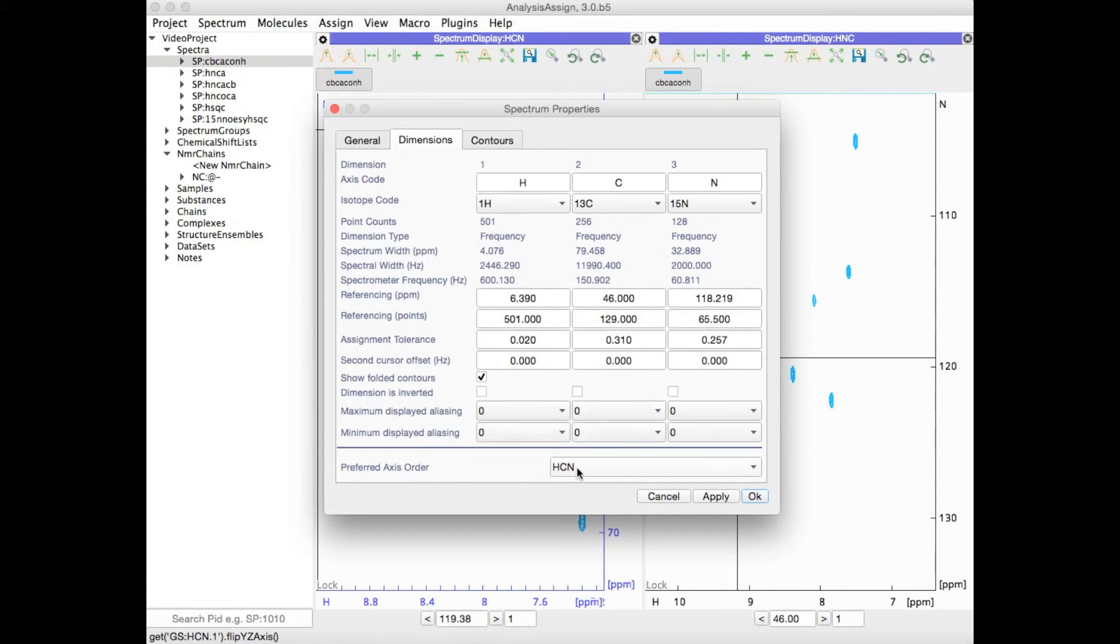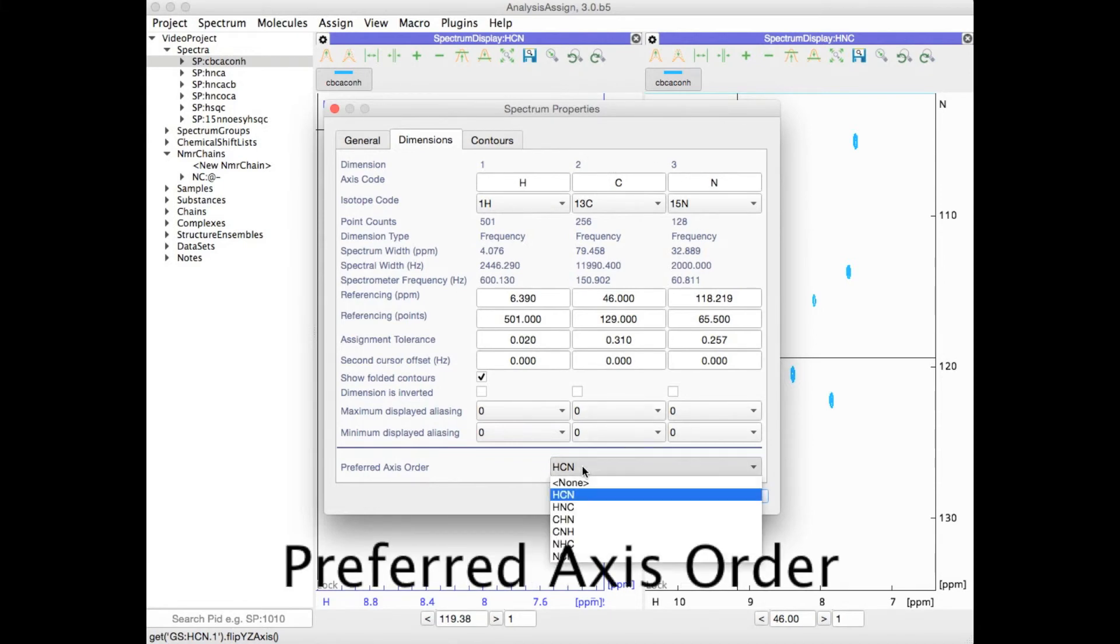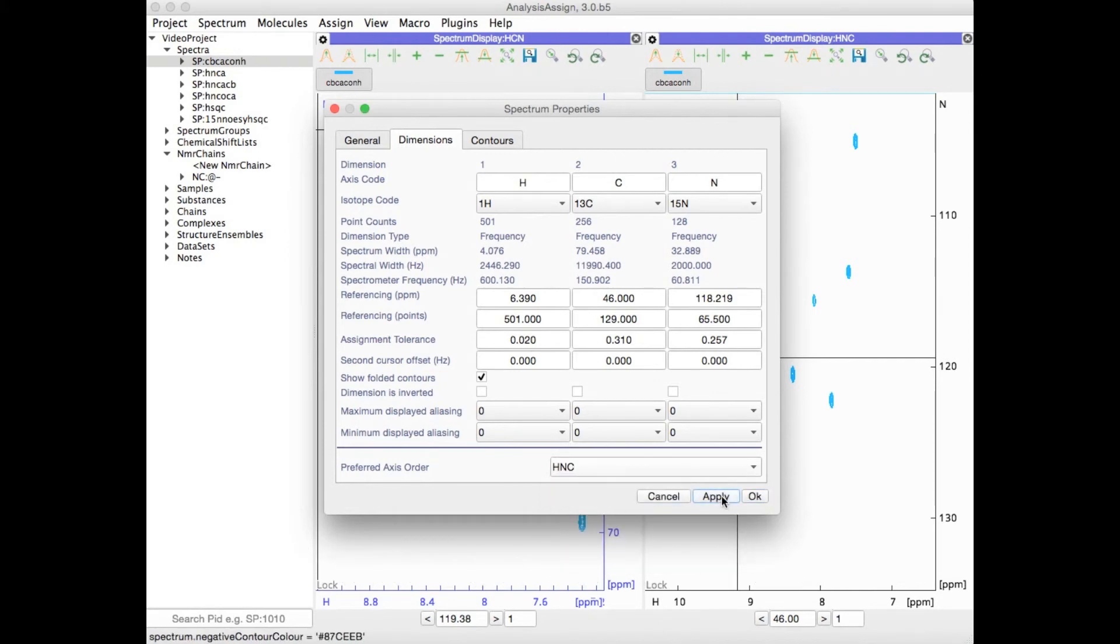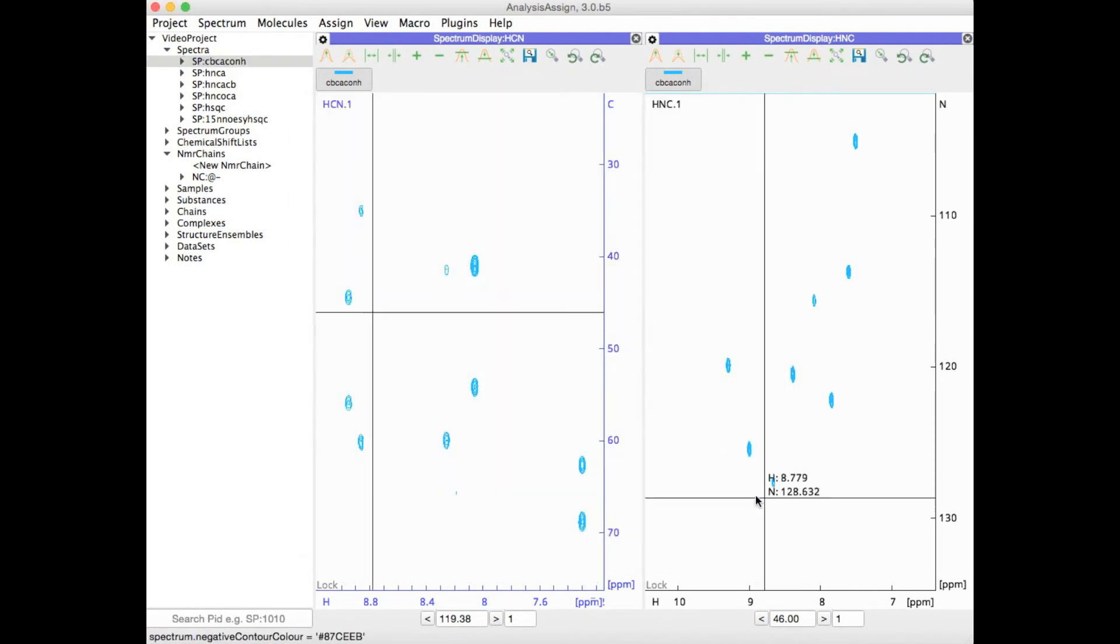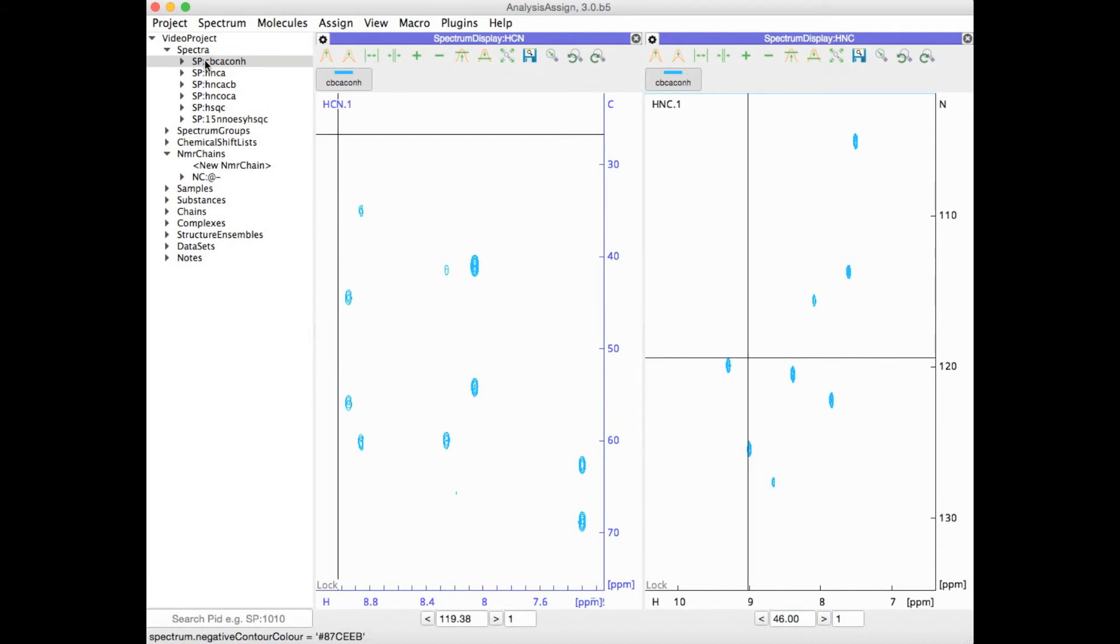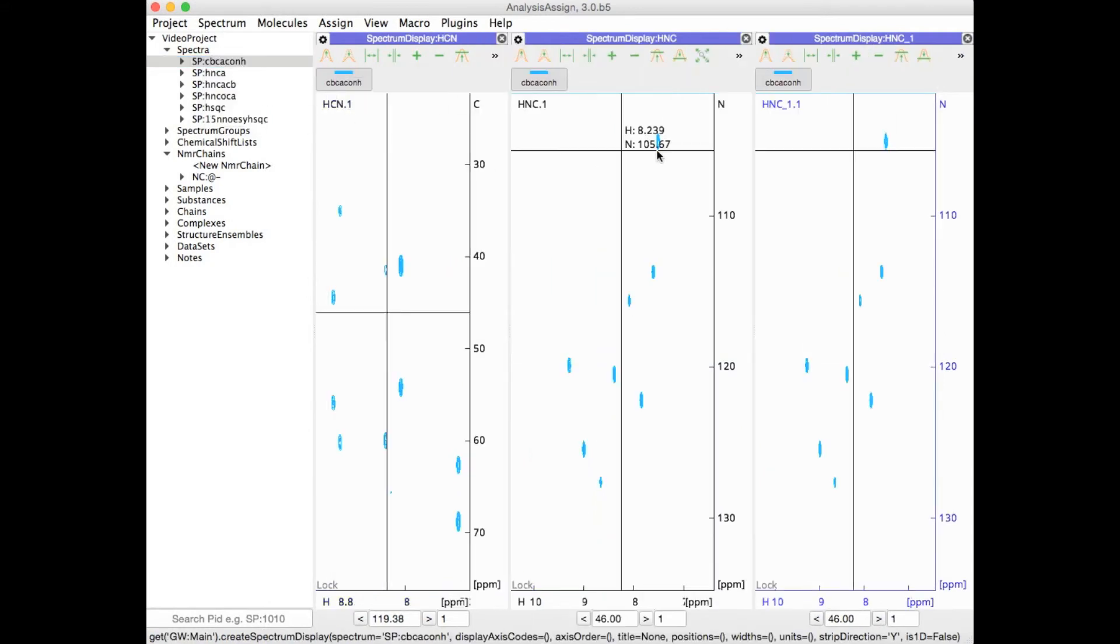At the bottom you can select your preferred axis order. I could now select HNC and say that's what I want as my default when I open a new module of this spectrum.